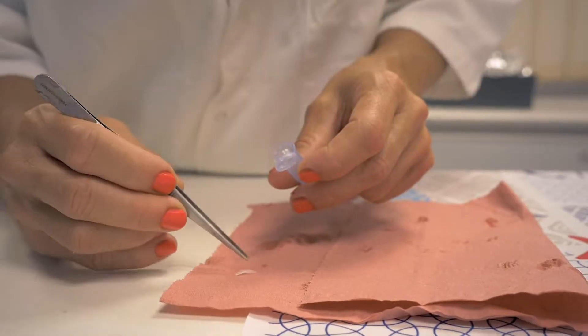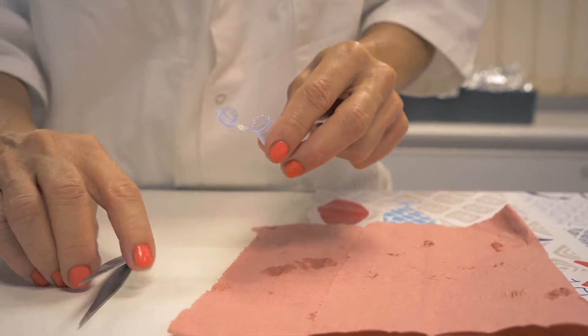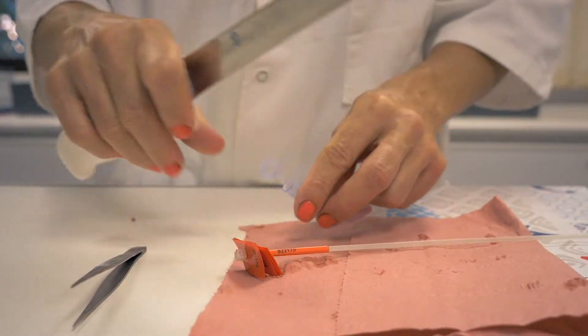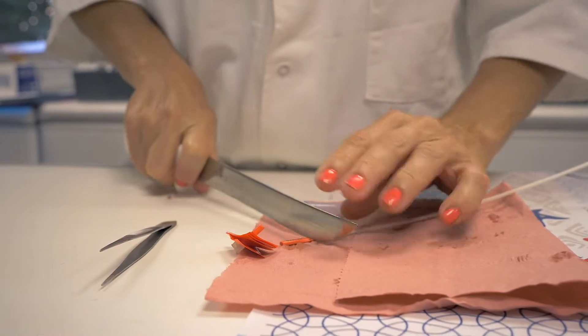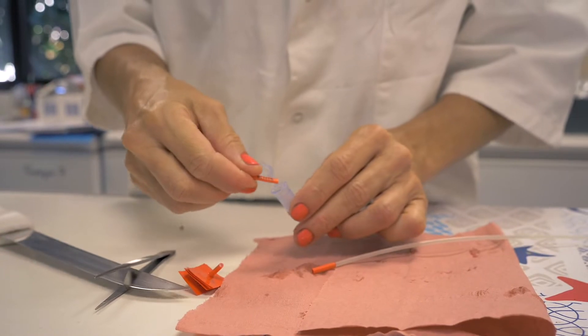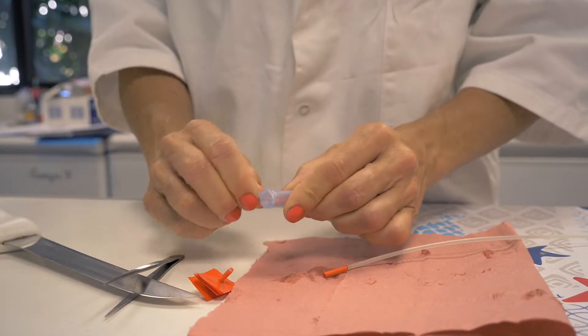Place the otoliths in the vial. Cut your cable tie to collect the label, and remember you can also use a plastic label from the cable if you still have some labels available on it. Place the label inside the vial and close it, making sure it's tightly sealed.